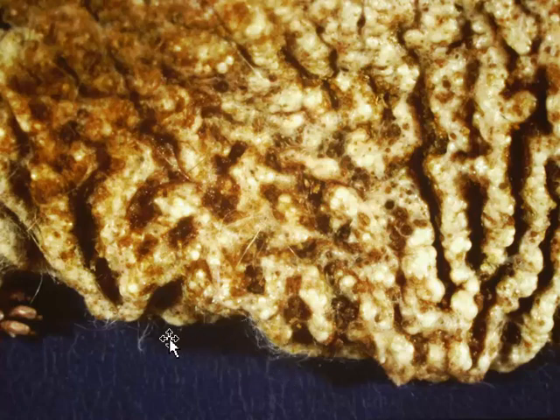There are hairs within some of these follicles, and it's not uncommon to see them in nude mice, but the hair shafts are somewhat dysplastic. They tend to break as soon as they emerge from the skin. So nude immunodeficient mice are neither nude nor are they generally immunodeficient, but they're as close as we can make them be.